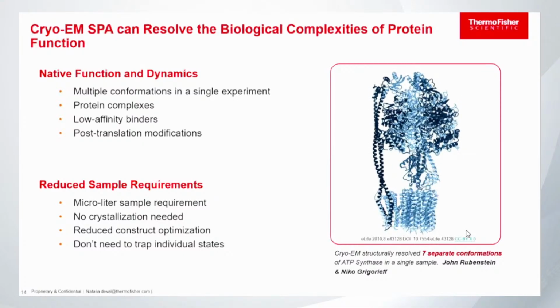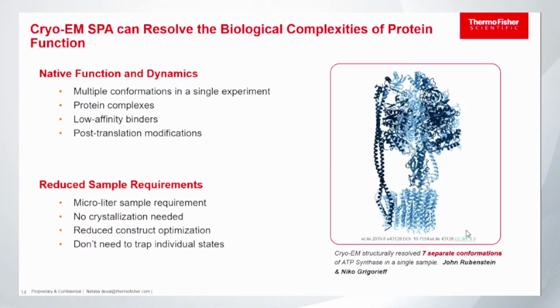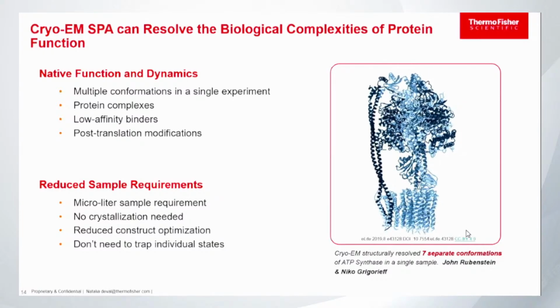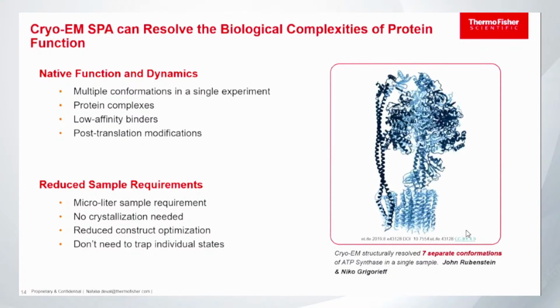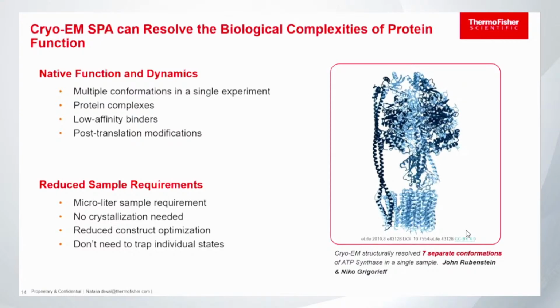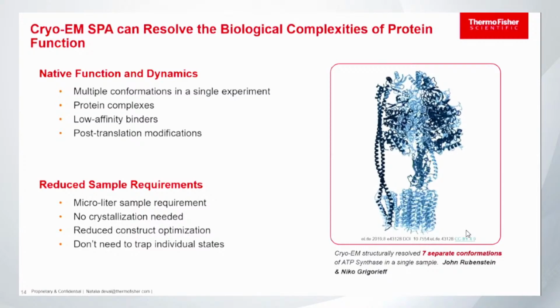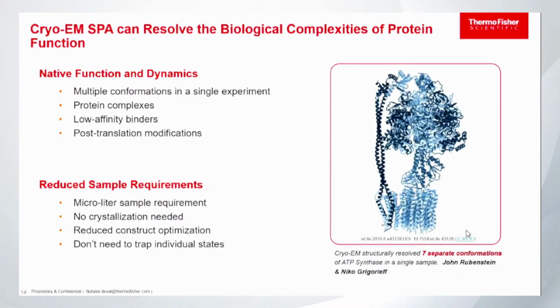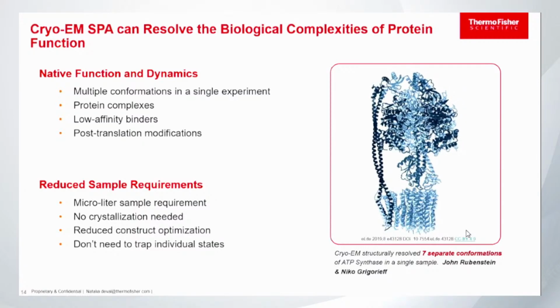That is on the scientific side. Let's talk about logistics. As I said before, I was a crystallographer, and for several years during my PhD, I was trying to crystallize, lucky me, membrane proteins. I don't know why I decided to do that. Of course, never happened. So you know what? The beauty of single particle is like you don't need crystals. Yes. So I was like, wow, you don't need crystals to do the experiments. No, nothing. And you need very small amount.